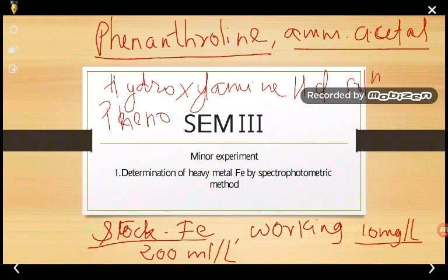So the requirements for this experiment are, first, hydroxylamine hydrochloride solution, next the phenanthroline, third the acetate buffer, and fourth the stock solution of iron.